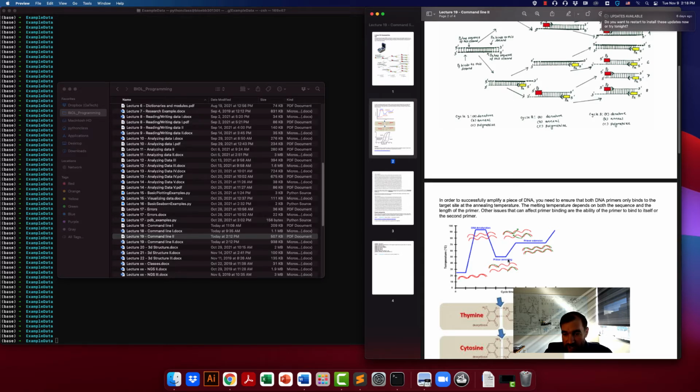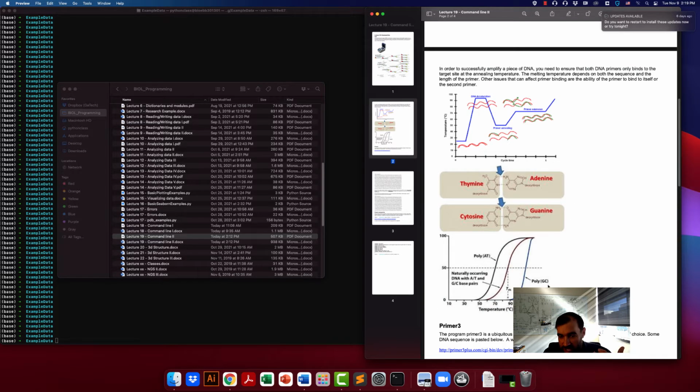And so the DNA becomes so hot that these strands end up separating from each other. And then you have the primer annealing temperature, and this is a temperature where the primers are able to form double-stranded bonds through hydrogen bonds with the template DNA. So these two original strands don't actually anneal together. It's this primer that anneals to this template strand, and then on this opposite one that this primer does. And then you have the extension temperature, and this is where the polymerase is active and it extends from the primers in order to create these new strands. So you do these rounds of 3 temperatures over and over and over again, and then as a result you have a ton of DNA.